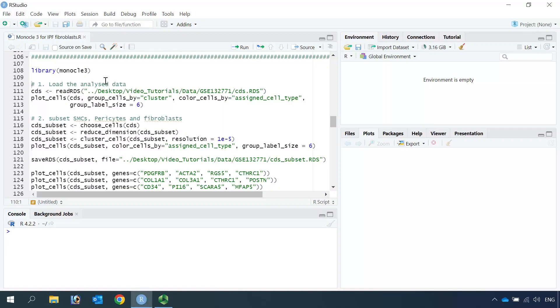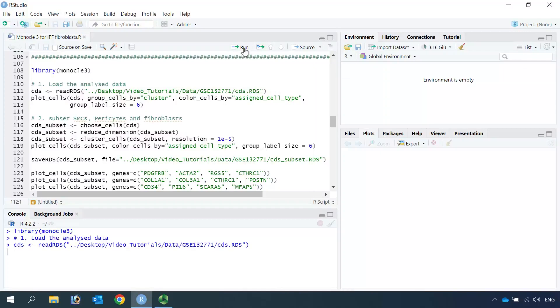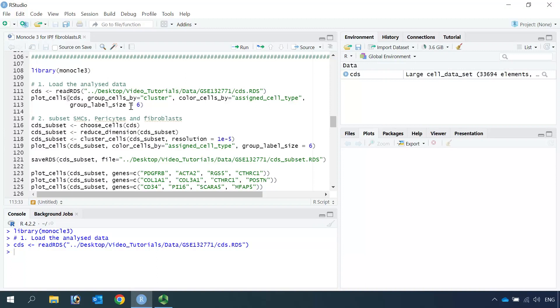So we just need to load the package in Monocle3, then we can read the saved CDS object into R. Let's plot the cells to check if it is the object that we saved last time.